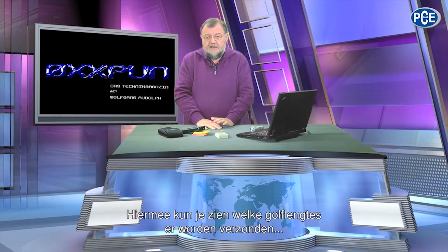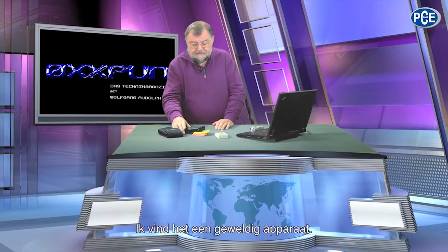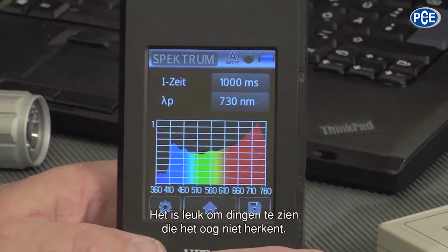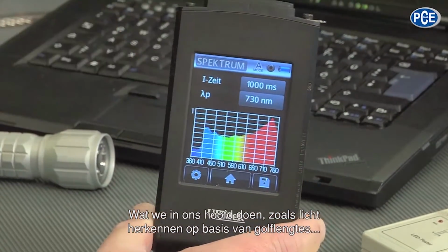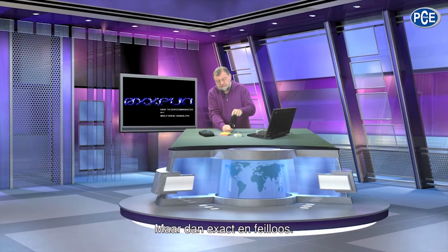With this you can see which wavelengths are emitted, and then of course in industry, production and so forth, it can be used for quality control and testing. A device which delights me, and it is fun to see things which the eye doesn't recognize. That we do in our heads, like recognizing lightness from different wavelengths, to recognize a color, this device does too, but precise and incorruptible.